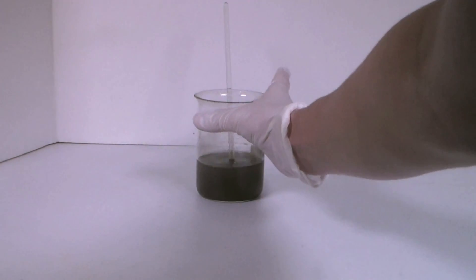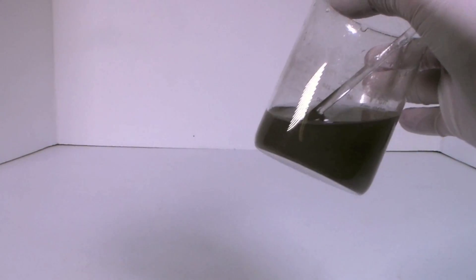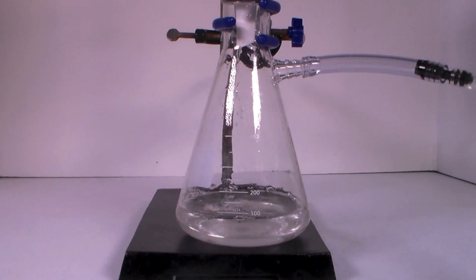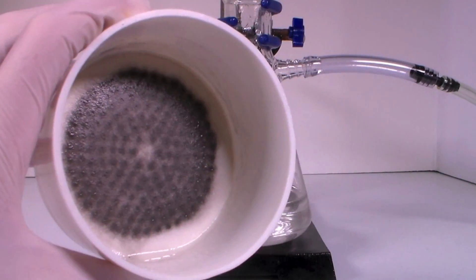After all the aluminum has dissolved, the solution contains aluminum chloride, but it is full of insoluble impurities. To remove the impurities, filter the solution. After filtering, you'll be left with a nice clear solution, and all the impurities will remain in the filter paper.